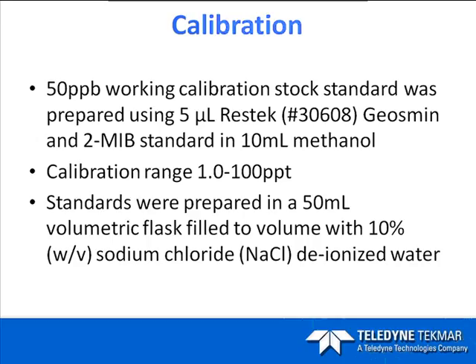Sometimes you can do it with heat. Sometimes you can do it with pH. One of the ways to do it is also with sodium chloride, because it starts to reduce that hydrogen bonding and allows those analytes to get into the headspace more readily.